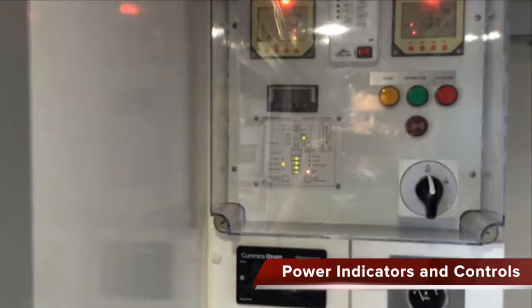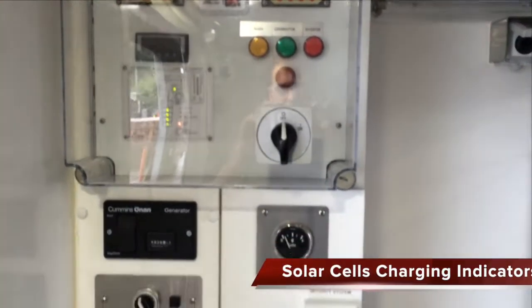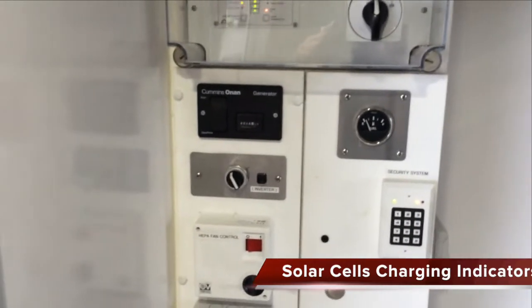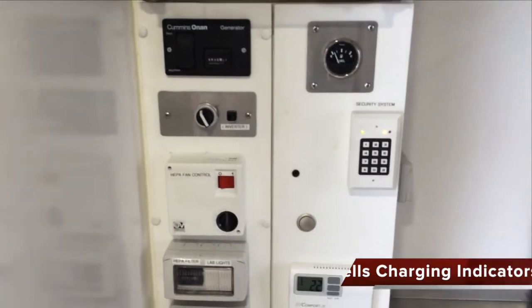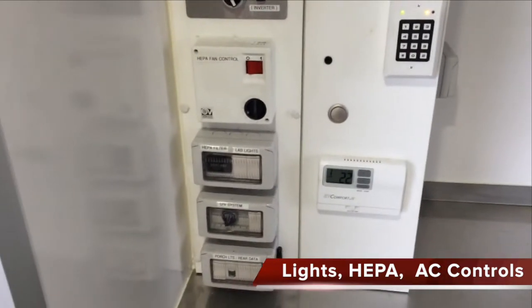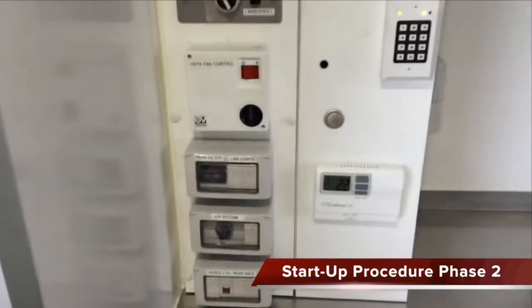You can see the inverter control panel, the main disconnect switch, a fuel gauge, the generator start functions, security system keypad, thermostat, HEPA controllers, miscellaneous timers, and light switches.